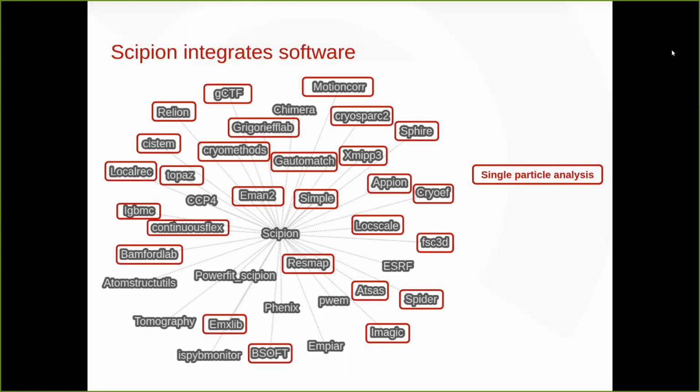Mainly, historically, we have integrated many single particle analysis software. Those are highlighted in red there: CryoSPARC, MotionCor, Relion, Xmipp, Cistem, Cryolo, and you can see them there.